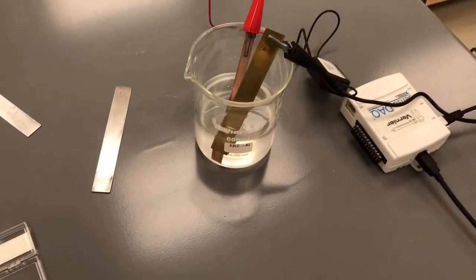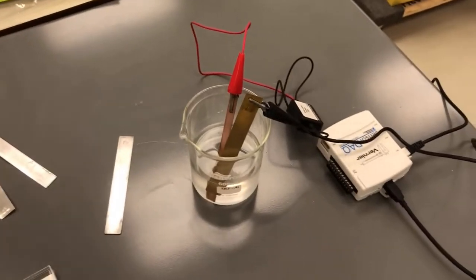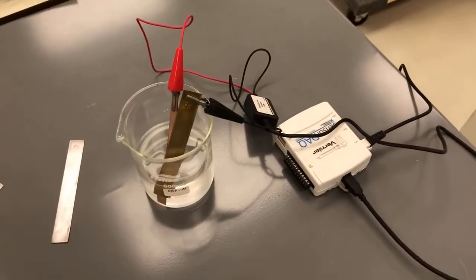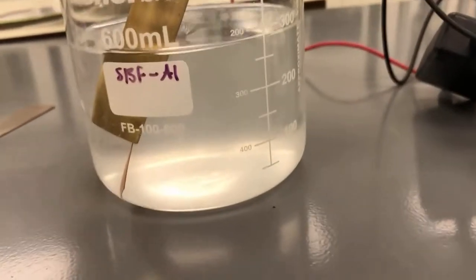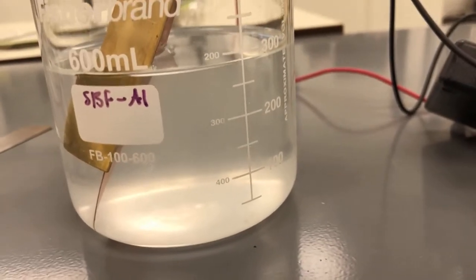Then we know what material is corroding. If it's positive, electrons are being pulled to the cathode. If it's negative, the anode is actually the real cathode material, so electrons are being pulled the other direction. We can look at, based on electronegativities, which ones will corrode or not. These are different from our standard cell potential because we're not using a solution of their own ions - we're using this salt solution.